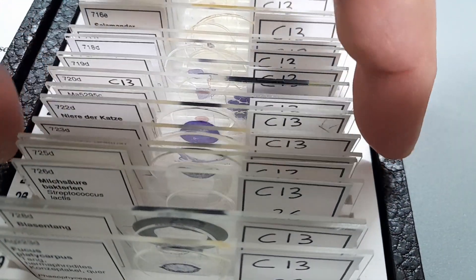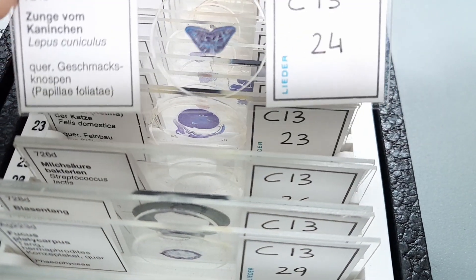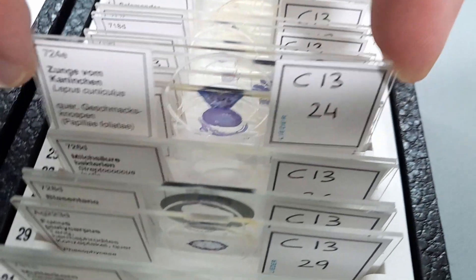I have a slide box with 50 slides, a nice little assortment of cross sections of plant and animal tissues and some whole mounts of insects. They had a possibility to look directly through the microscope, but I also had a little monitor next to it so we could watch the things together on the screen as well.